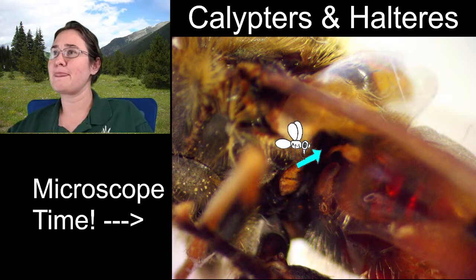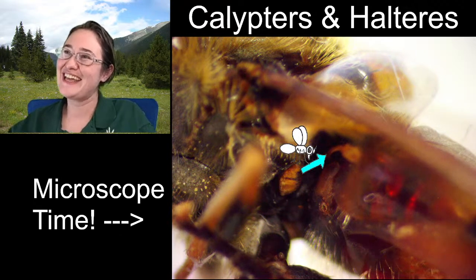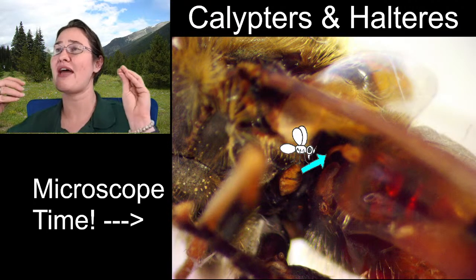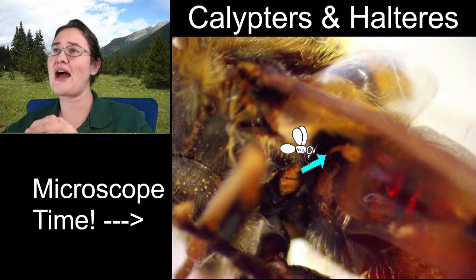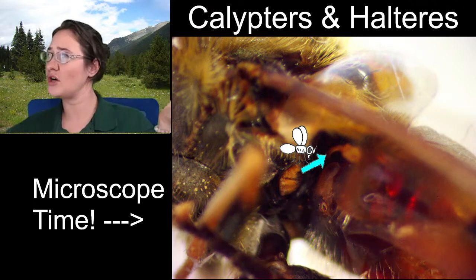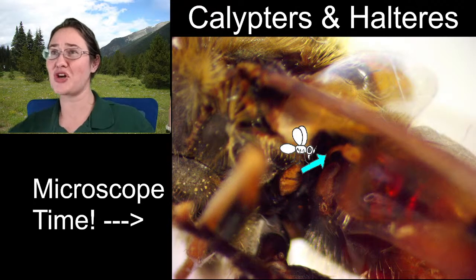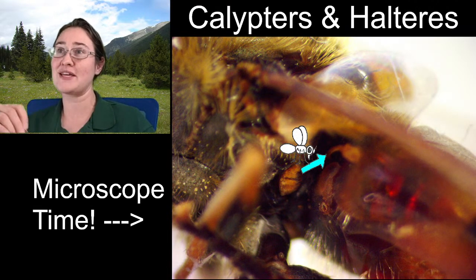So right here, you see that there, it looks like there's this little stalk with a ball at the end of it? That is a halter, and it's kind of in the location that the hind wing should be in. If you're looking at exactly where it's connected to the body, it's kind of like the fly lost a hind wing and gained a halter. Now you may ask, what in the world is a halter and why do they need them instead of having wings? Now, I'm talking to adults now, you may know what a gyroscope is. So, the halteres are going to help the fly balance in the air.